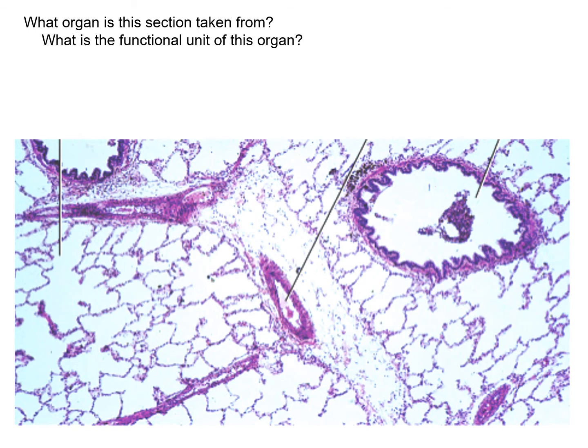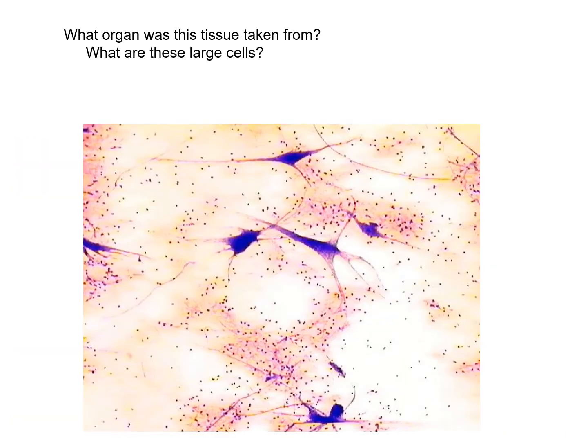The lung. It is the lung. And what is the functional unit of the lung? Alveoli. Yep. That one was a struggle yesterday.